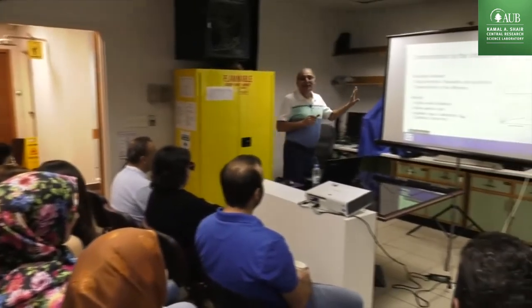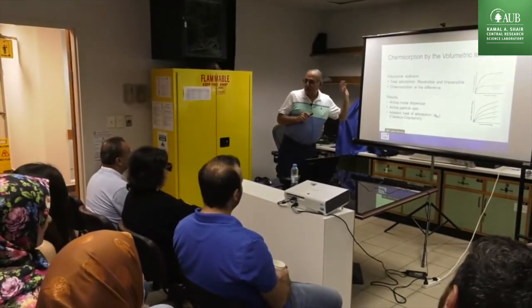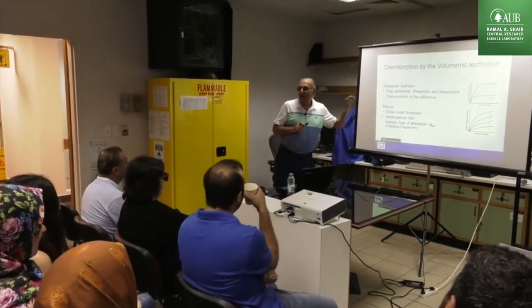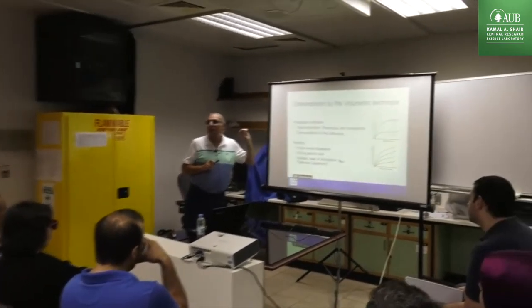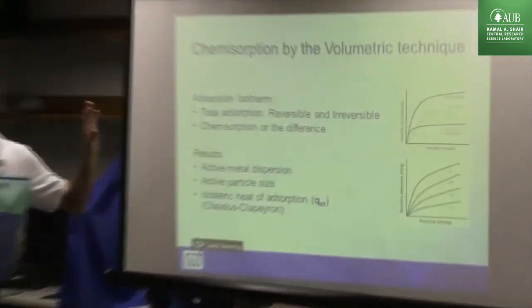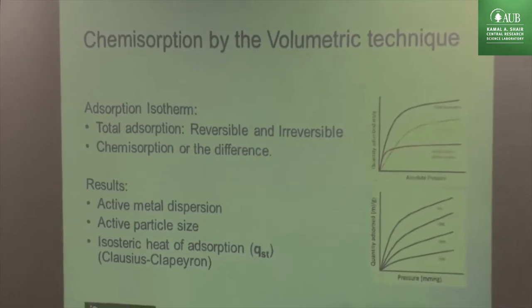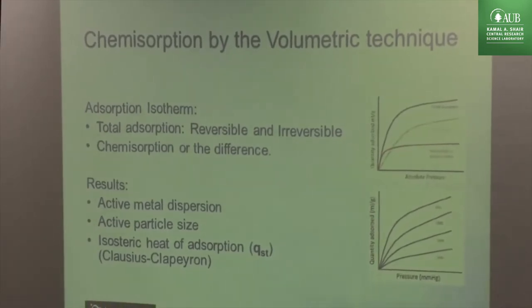This is nice. You're going to use these techniques because now you have the instrument, and you will see how nicely you can present your paper and publish it if you can explain these techniques very well. You can prevent, for example, taking your catalyst into the reactor and testing the catalyst, and you can do it very fast with chemisorption.